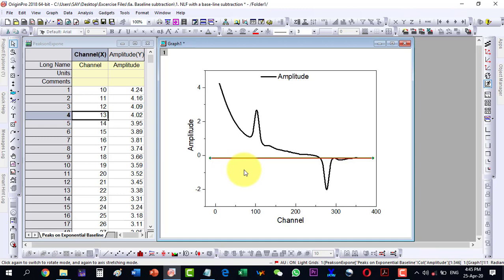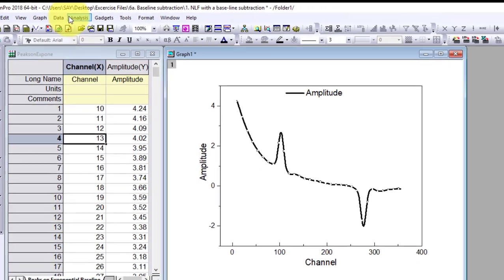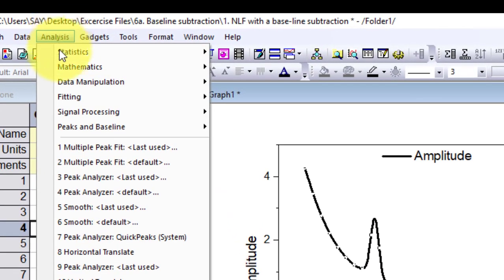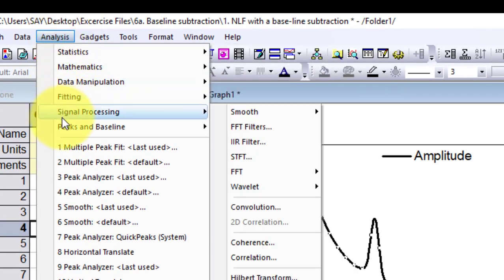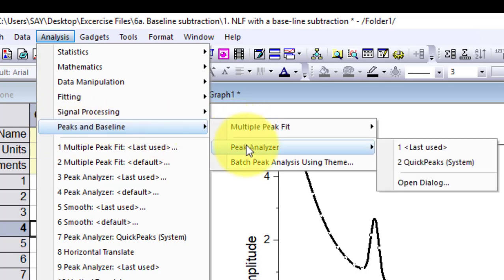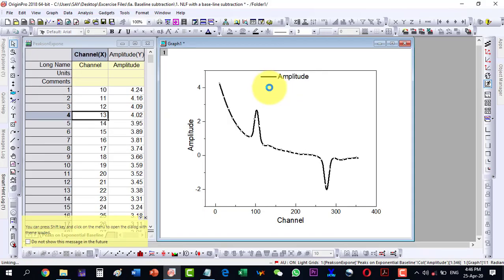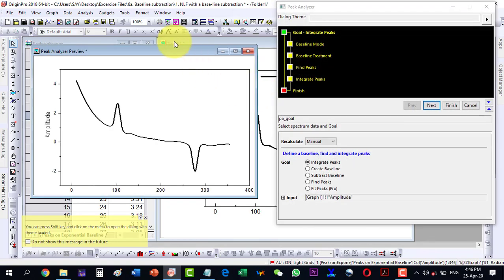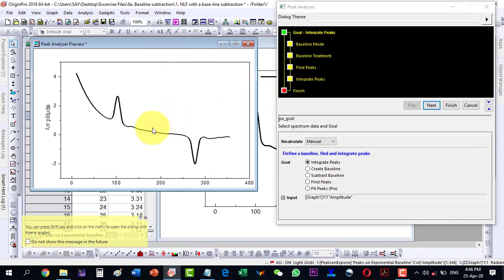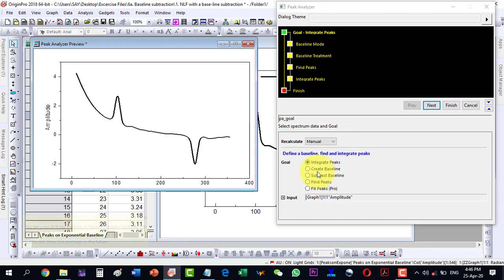Let's go ahead with the baseline correction. Click on Analysis, then Peaks and Baseline, then Peak Analyzer, and then Open Dialog. A menu will appear with a preview. We are given two options: Create a Baseline and Subtract a Baseline.